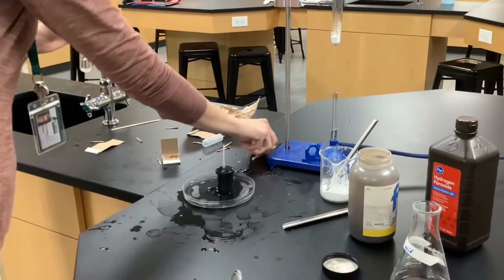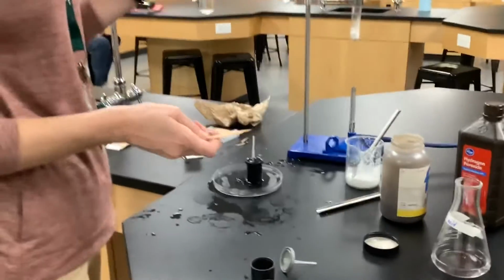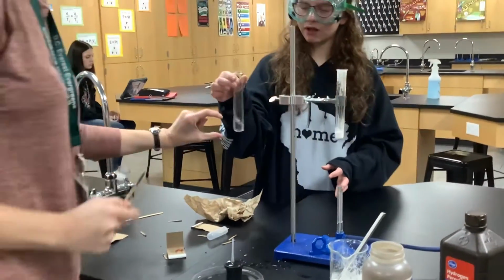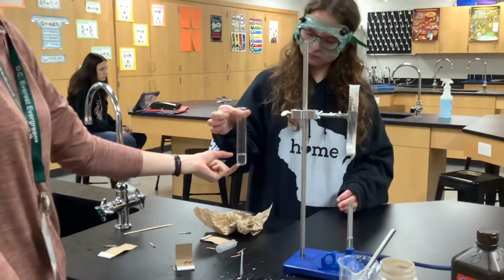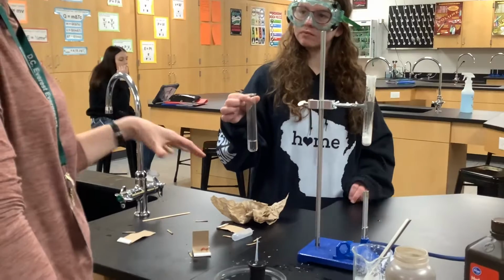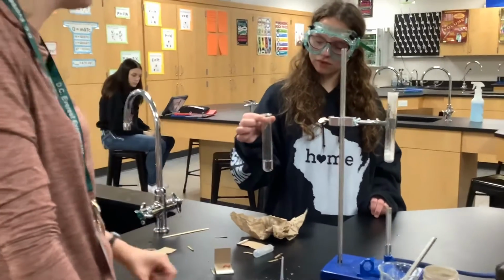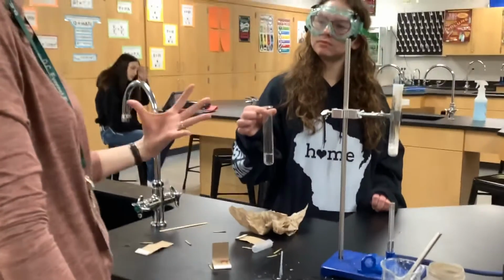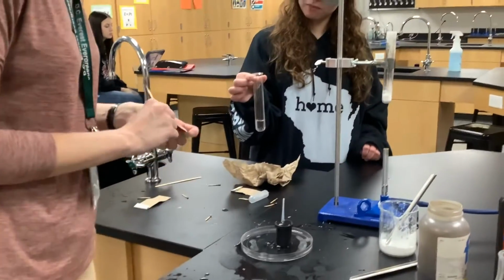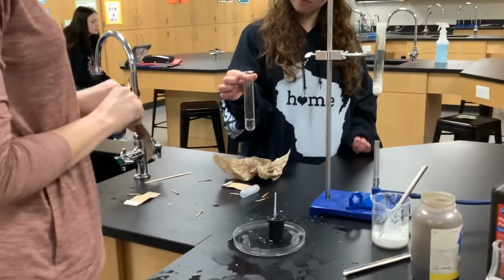I need one more set of hands. Who wants to do it? I'm gonna hold up the top here. So hold at the top, because when this decomposition happens fast, it's gonna produce heat. So if you were holding it down here, it would probably get warm enough that it would be uncomfortable and it would surprise you and you'd drop it. It's not gonna get hot enough to burn you or anything. So I wanna have that ready to go too.